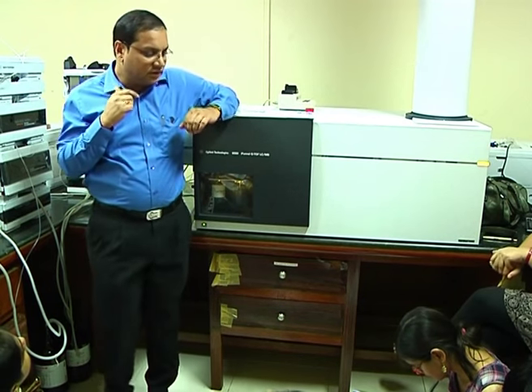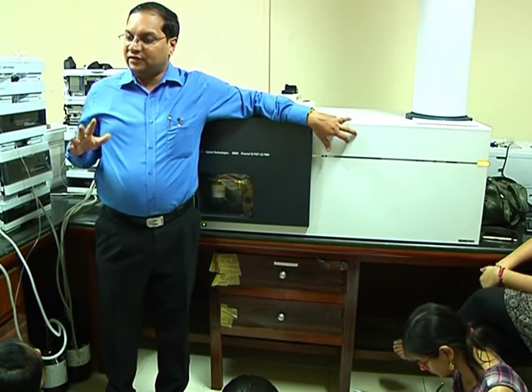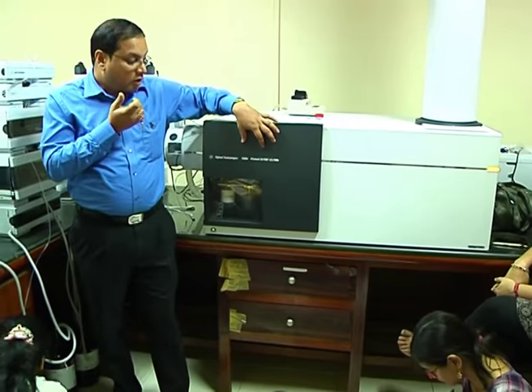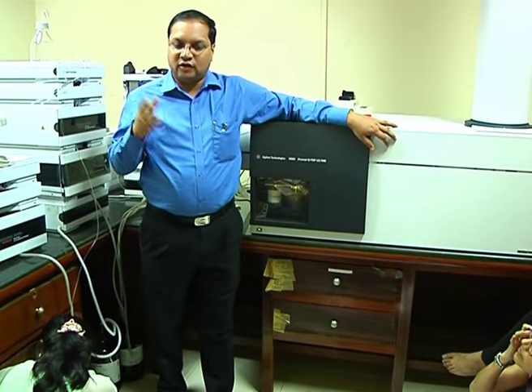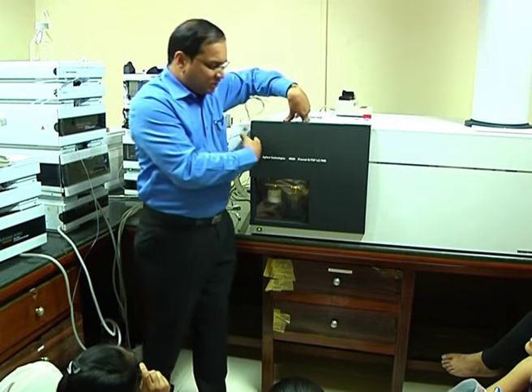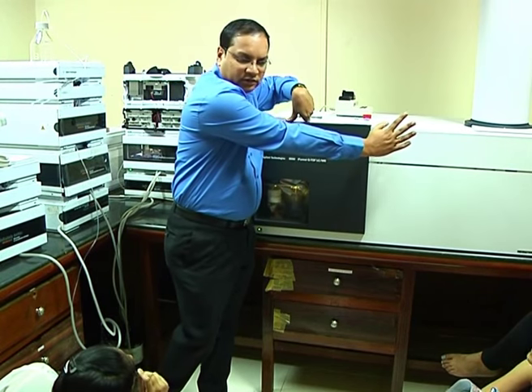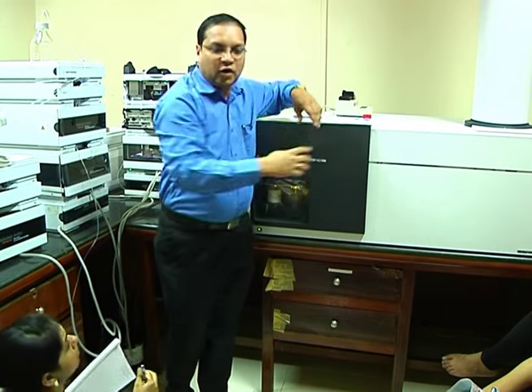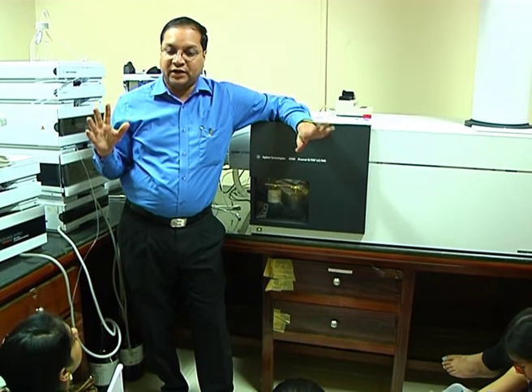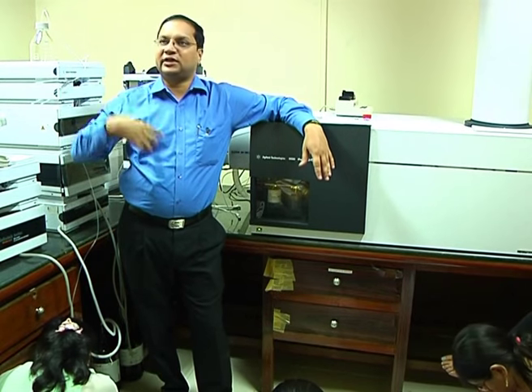When I say MS only, it means my quadrupole and collision cell are not behaving as they normally do. Quadrupole will not filter and collision cell will not fragment. So all ions which are going in will simply pass through the quadrupole, simply pass through the collision cell and go to the TOF, and TOF will scan. PMF type of approach, peptide mass fingerprinting, based on only mass. You get the accurate masses of all the peptides, then you search.